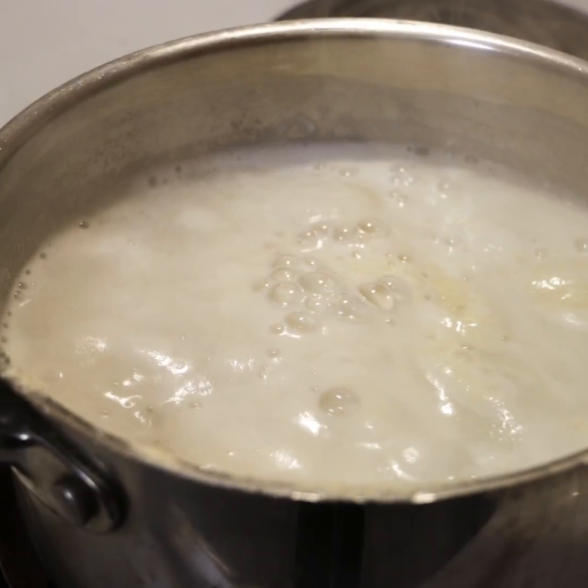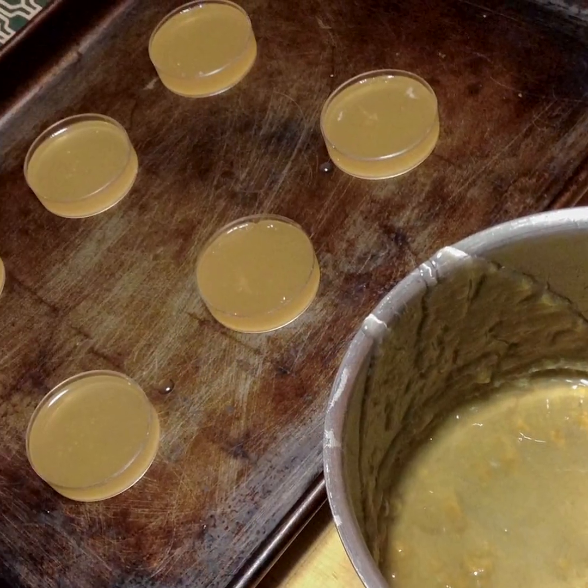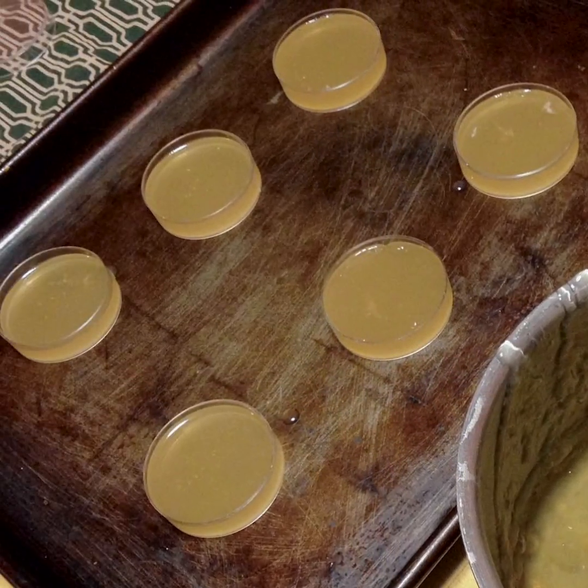To make the agar plates, boil up a batch of starter wort, but add the agar powder while it's boiling. As it cools, the wort will start to thicken into a nice gooey substance that you'll be able to pour into your petri dishes. Let the agar plates cool overnight to make sure they're not contaminated with any unwanted bacteria.